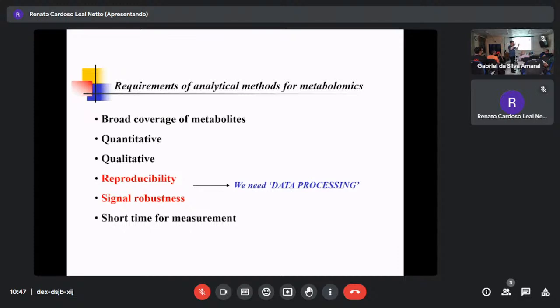When they compare, it's higher. This one is high molecular. But in mass cases, as he mentioned, it is not exactly more concentration. Flavonoids are very well ionized, very high signal. Sugar case, it's very difficult. Even if you put in one small signal, based on this one, it's a small signal, it's a higher signal. I wouldn't say flavonoid is higher in this case. That is an ionization problem.